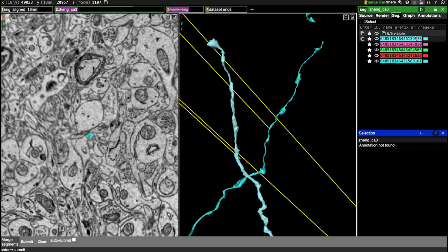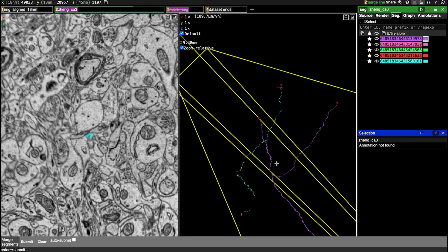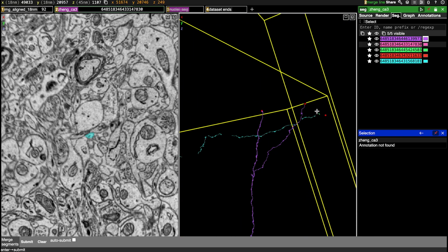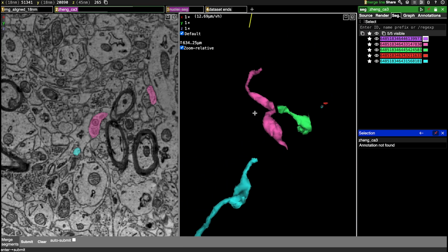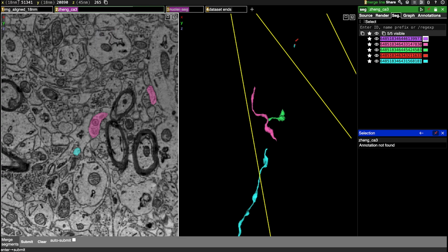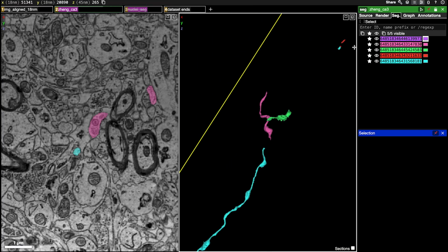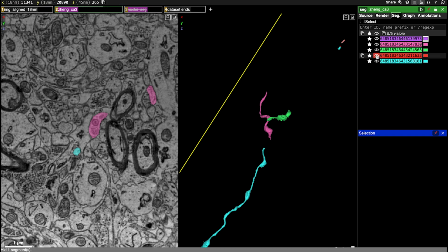Okay, I don't know why it insists on having my two main segments be very similar colors, but for some reason it is very insistent on that, but I'm gonna change it so that we don't have that. Okay, and then the other segments that we had, it looks like were these mergers. Just refresh because this is not quite loading in. And this little extra segment that I decided to not include, so I'm gonna delete that. Oops, I'm gonna unstar that, make sure you're doing the correct one.